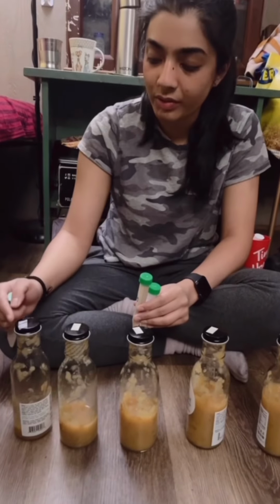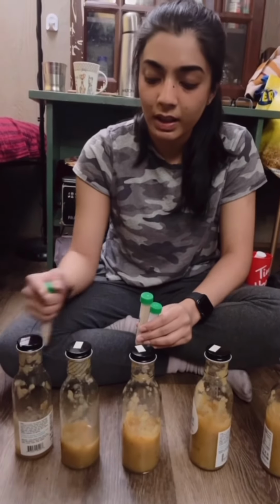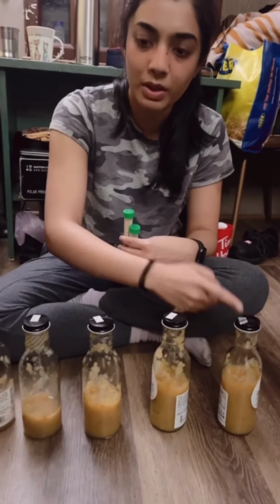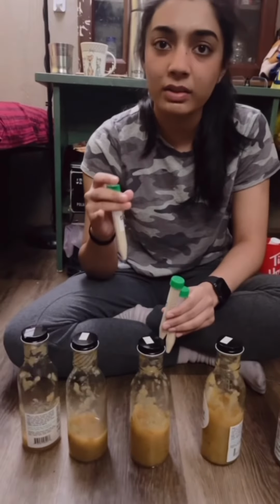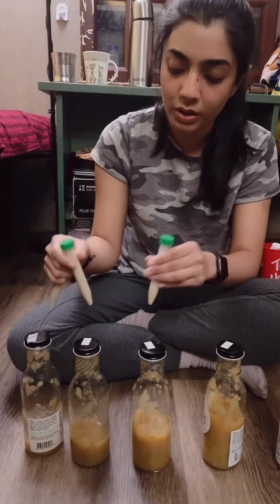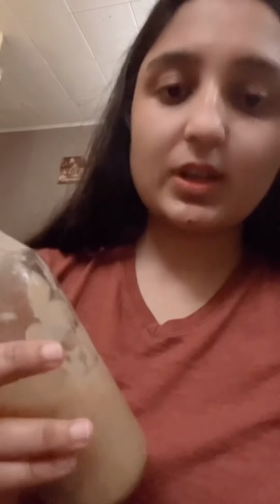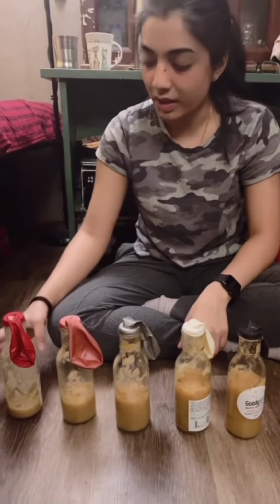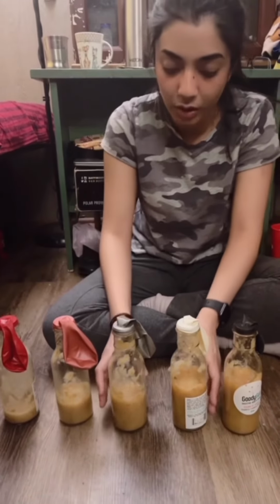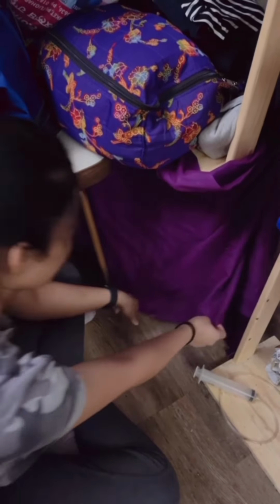So for week 2 of our first trial, we have used 50 ml mush of apple, 100 ml mush, 150 ml mush, 200 ml mush, and for the control 250 ml mush. And then we are going to pour activated yeast, which contains 2 gram of yeast with water, and we are going to pour each of these tubes in each of these bottles, but not in the control. After pouring the yeast, we shake the bottles well. After shaking, in all 5 bottles we have attached the balloons to measure carbon dioxide on the top of each bottle like this. These 5 bottles we just kept in the dark and covered like this.